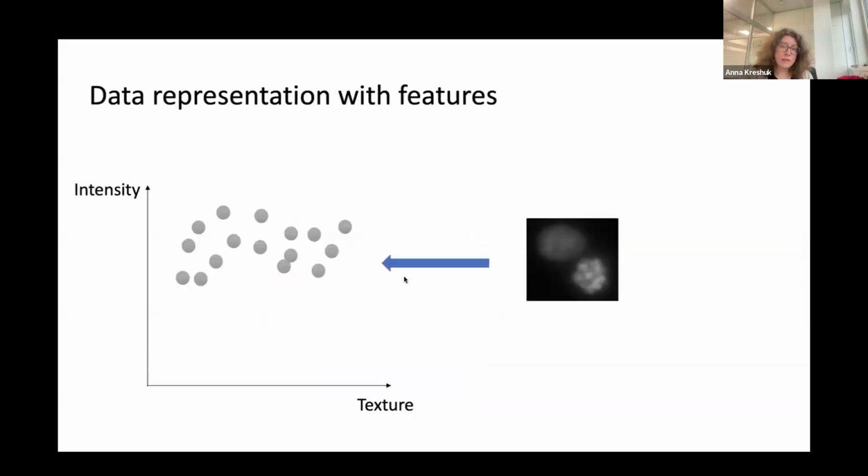And the way that works is that you start from your data, and then this data is already projected into some kind of a feature space because you thought of this. And you have to remember that, of course, in the absolutely ideal world of fluorescence microscopy, you would now have your foreground pixels clustered somewhere completely separate. But this doesn't happen in practice. And so in practice, we actually need labels to decide where to draw a decision boundary.